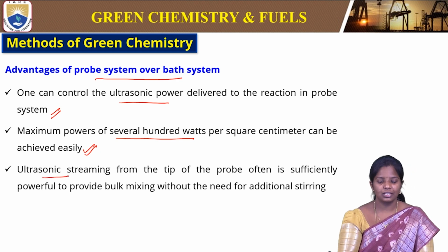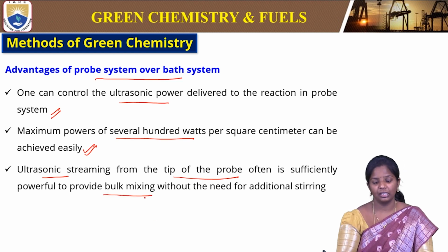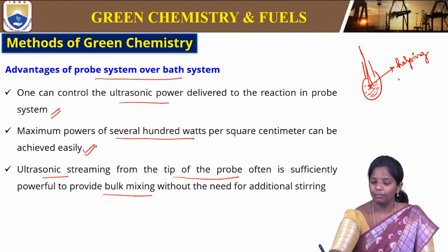Ultrasonic streaming from the tip of the probe often is sufficiently powerful to produce bulk mixing without the need of additional stirring. Whenever we introduce the probe inside the reaction vessel, it helps in mixing, because we are directly introducing it into the solution.